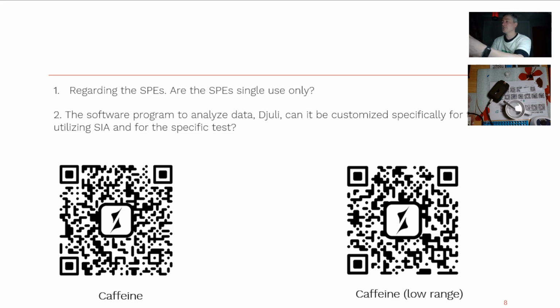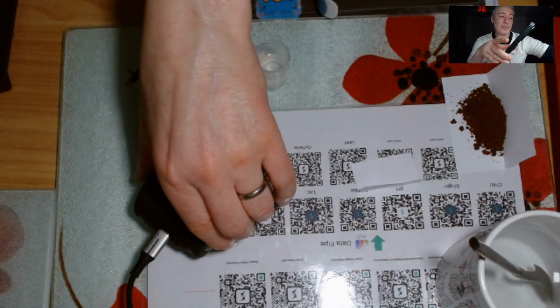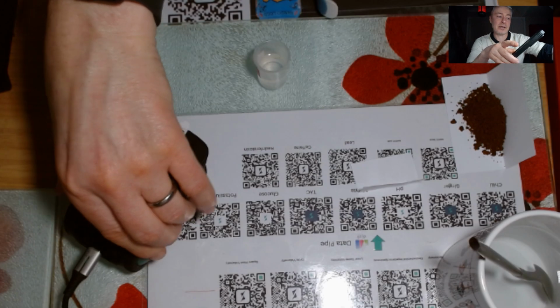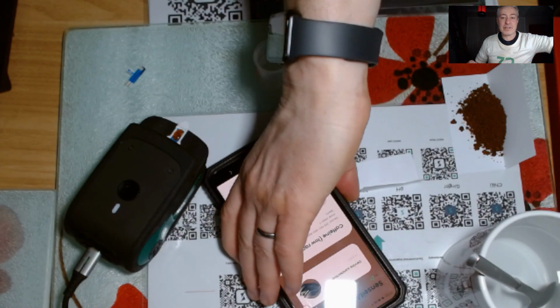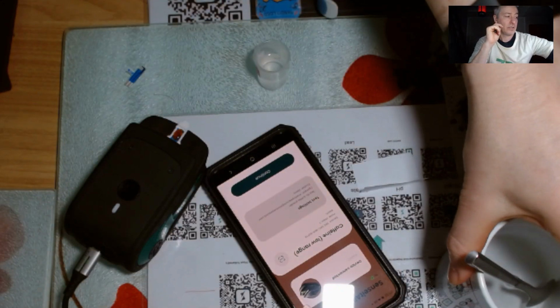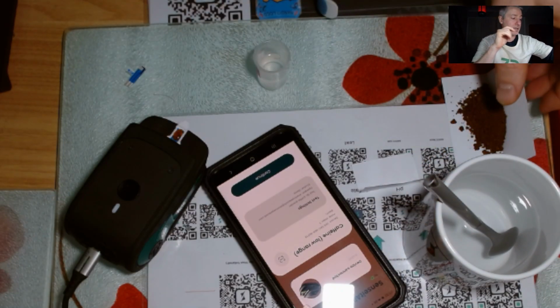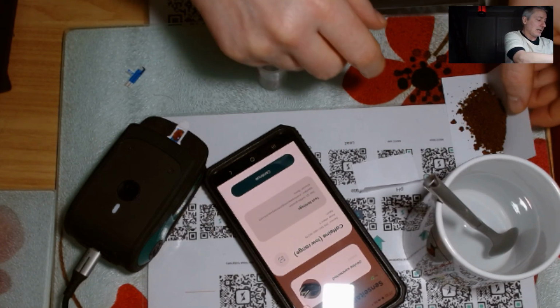Right, so now I've turned this into a different facing app. It's a really interesting point, because it's the same assay, but what I'm now going to do, rather than measuring caffeine in a powder, is measure caffeine in a drink. So I've got a cup over here. This is almost like I'm making coffee, so excuse me if I spill anything. I'm going to do this live.